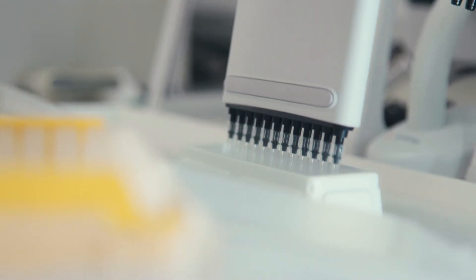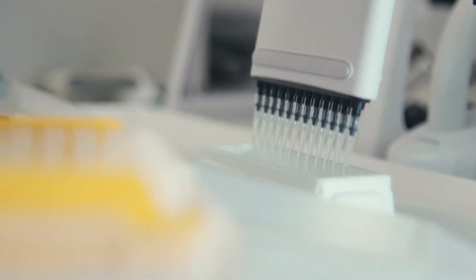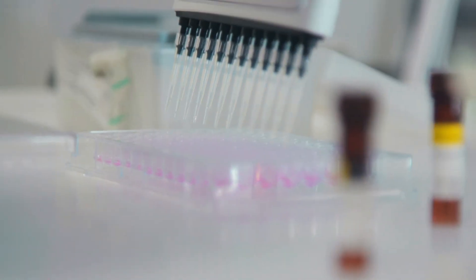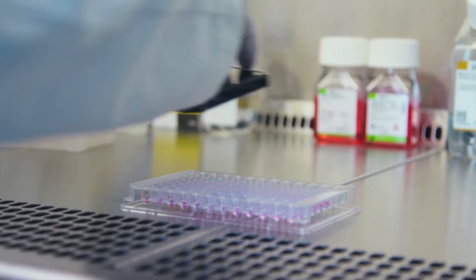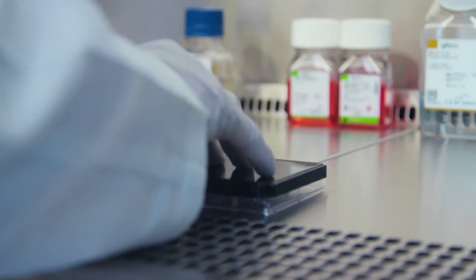The assay protocol employs a simple three-step addition into the assay plate. Firstly, 20 microlitres of your sample or control, then 5 microlitres of the detection reagent, and then finally 5 microlitres of IgG capture beads. Here I'm using a 96 well plate, but this is also suitable for a 384 well format. The plate is then incubated at room temperature for one hour, protected from light.